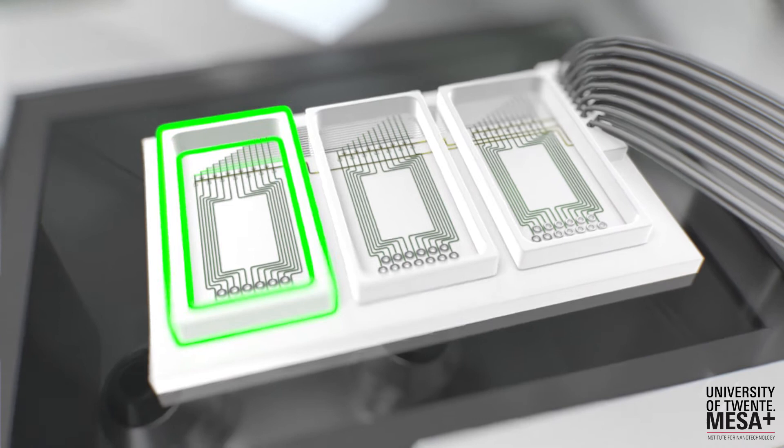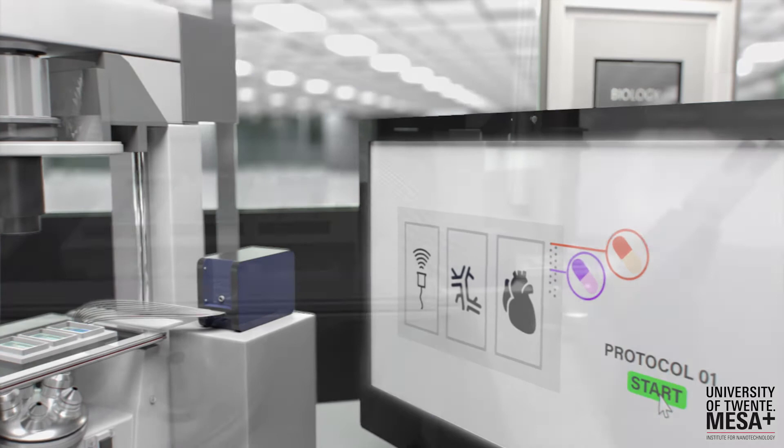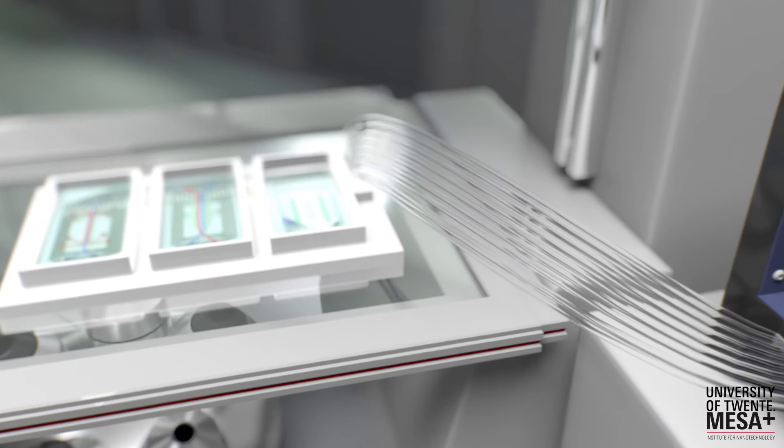As a biologist, you can run your biological protocols automatically with the click of a button. You just select the chips you have clicked into the system in the way you see fit, set the parameters, and hit start.